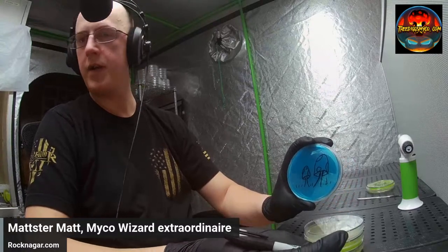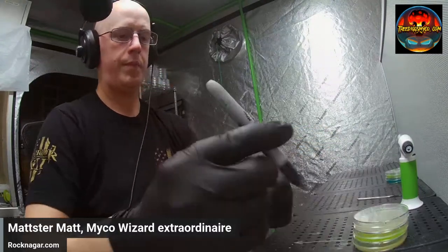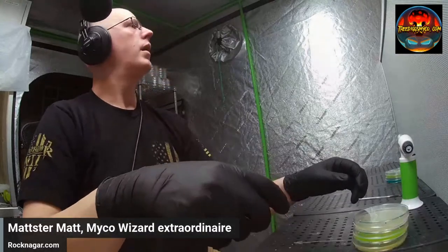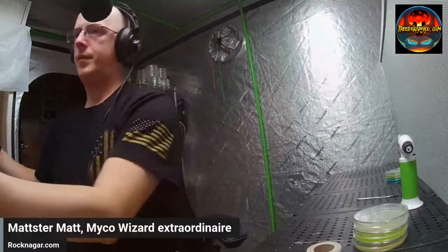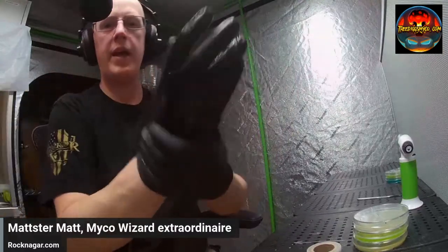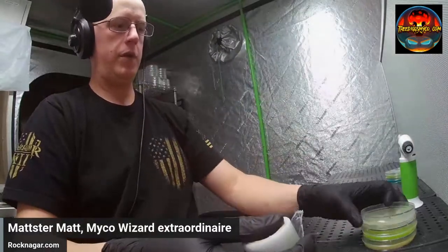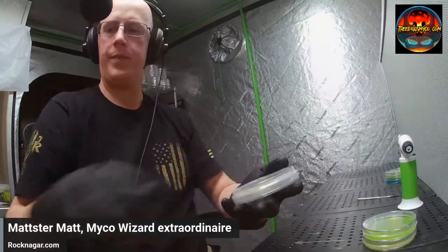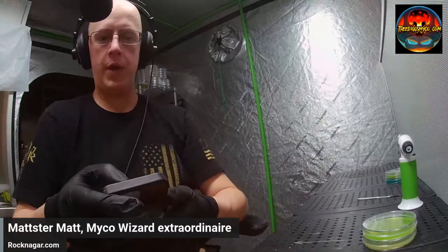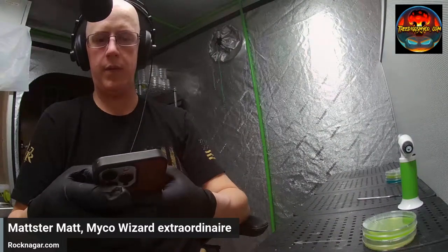Guess it'd help if I took it out of the glare. All right. So, how do I want to do this? I'm going to do it backwards because I only have a couple of these PDA plates and only one of them that's clear here, but I want it to be clean, so pull it out and we will look up a skull tattoo. I like that.